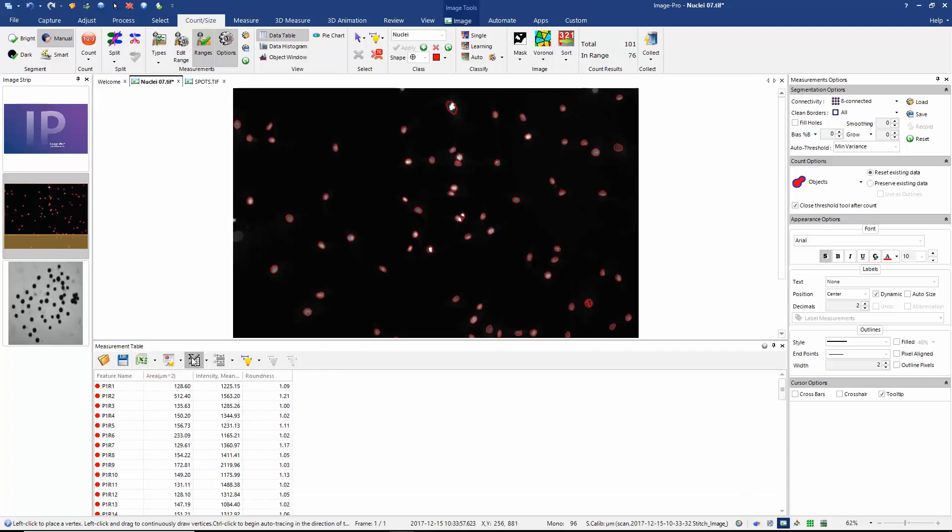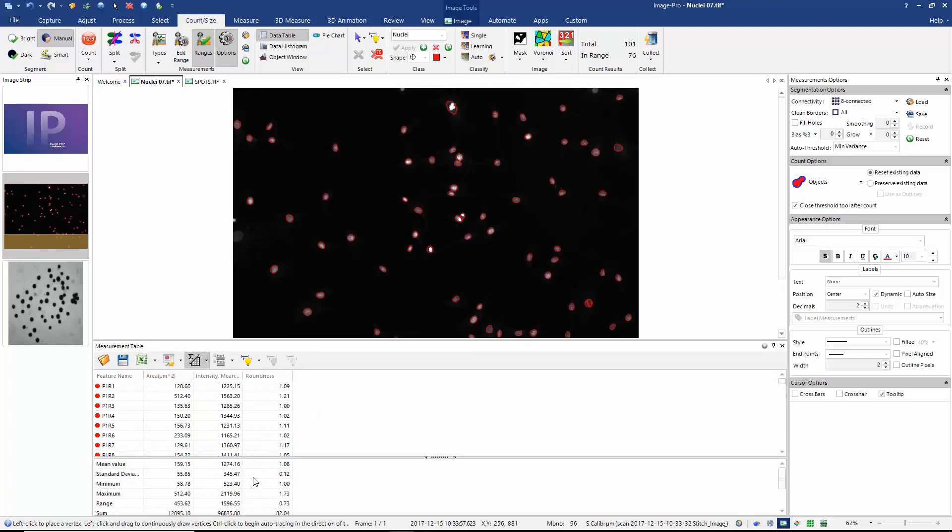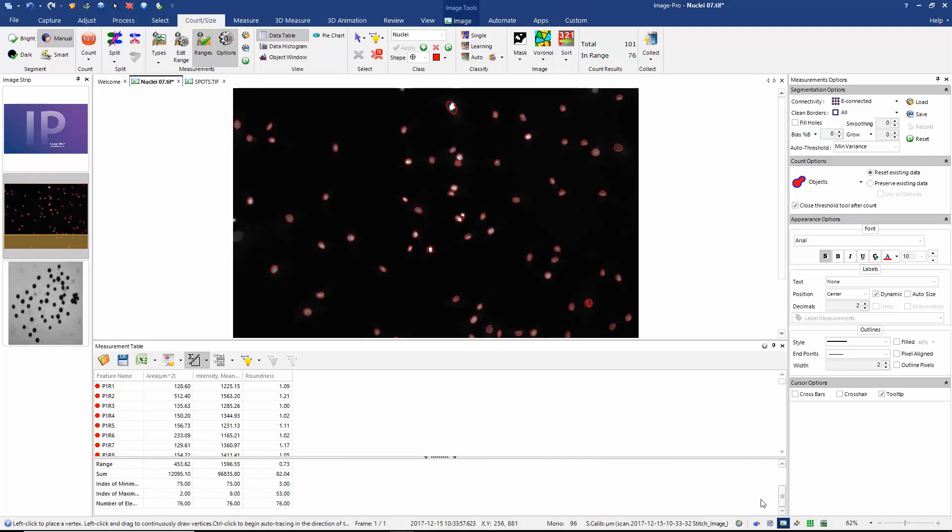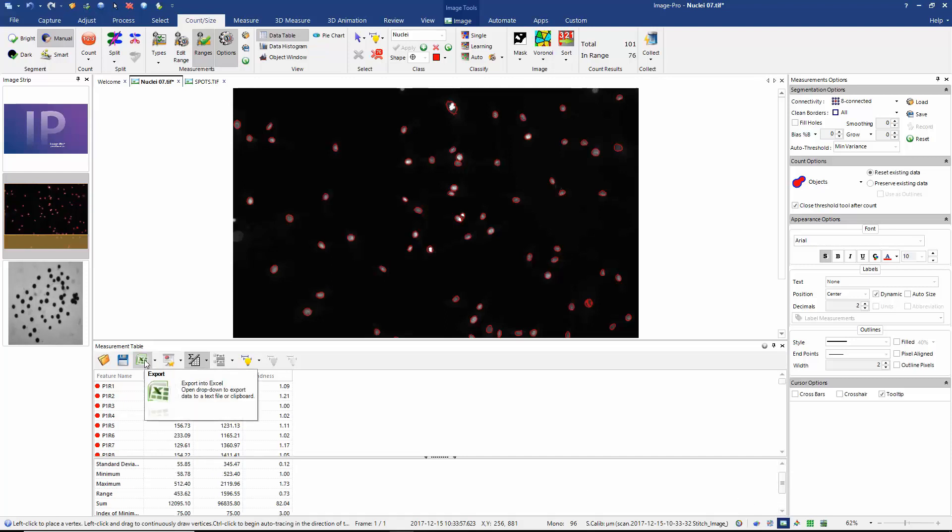And if we look at the statistics tool or the statistics summary, we can see that we have a mean area of 159 pixels. I can see my mean intensity and my mean roundness. And if we look in the table here, I can also see that I've found a total of 76 nuclei. If I wish, I can export my table straight to Excel.